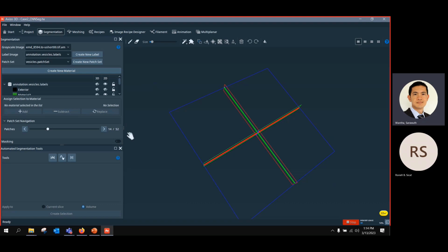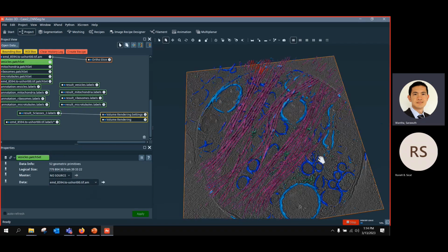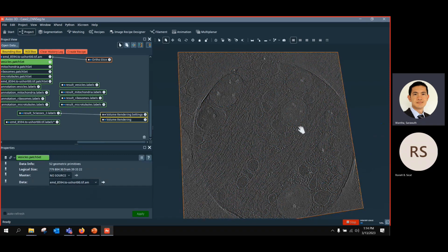You can train on one similar image. For example, if you have this image here and you have maybe 100 similar ones, you can just train on one image and create one model. It's called an architecture file, and you create a weight file. Then you can use the model on the rest of your images that have similar structures. But for this image, you need to create a segmentation ground truth that has to be very precise to get a good quality result.